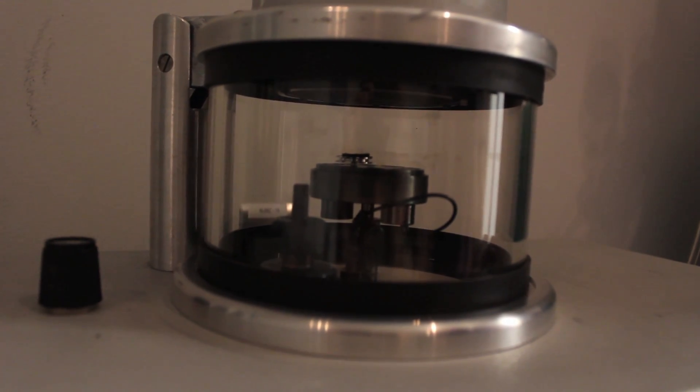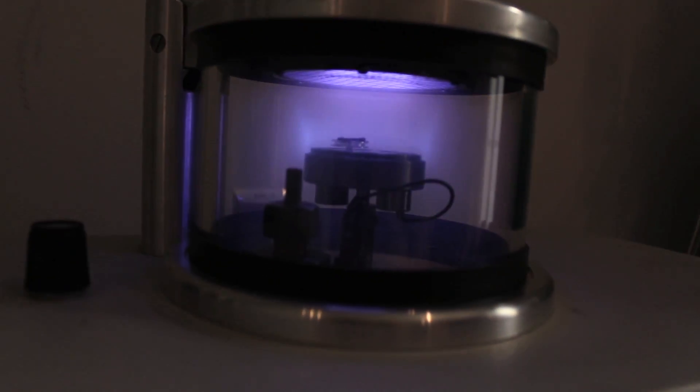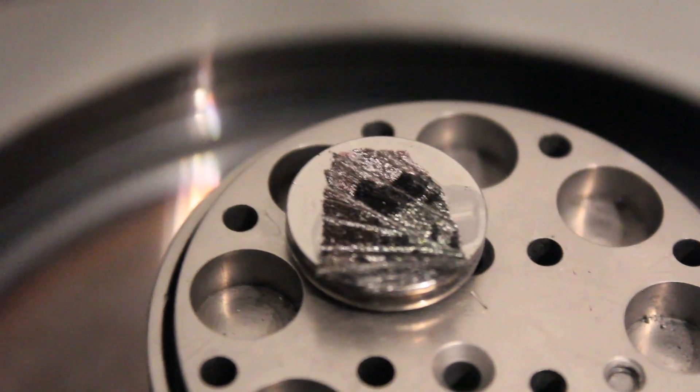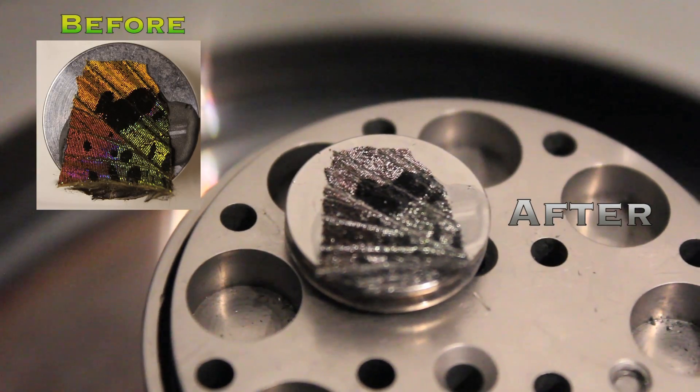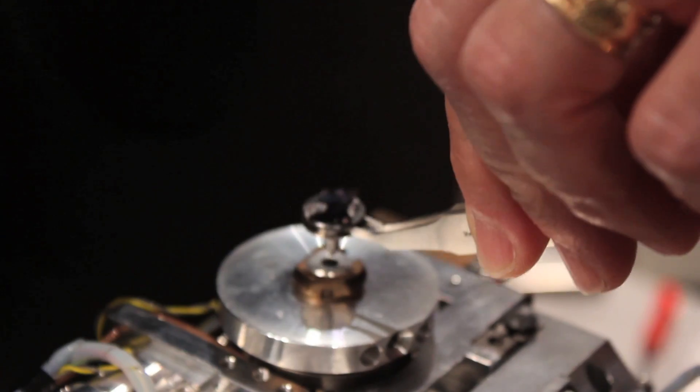Three, two, one — I'm going to hit start. So that's a gold cloud. These are gold and palladium atoms flying around in an ionized argon atmosphere. That's got a fairly heavy coat on it. So that's gold — 60% gold, 40% palladium.